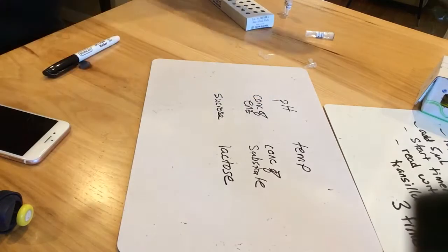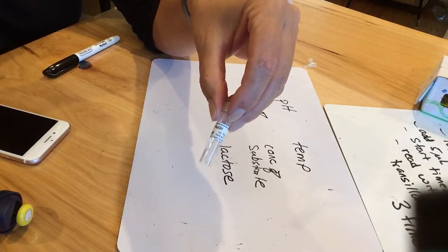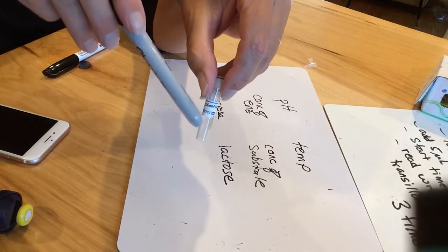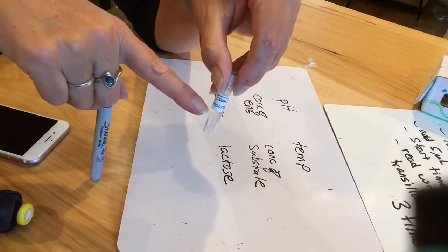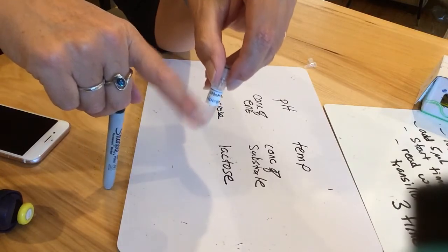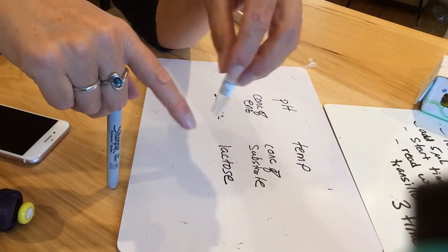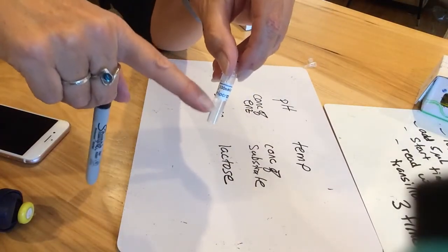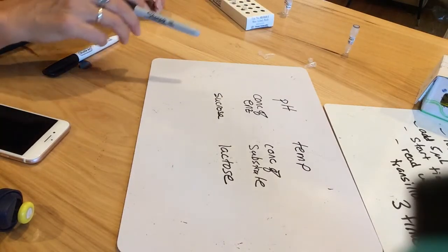And so with pH, you're going to be given a fairly dilute concentration of sodium hydroxide, so you're going to increase the pH by adding small amounts of this sodium hydroxide. I want you to be very careful with this. It can really be bad for your eyes, so you're going to wear gloves when you're handling this, and safety glasses. And if you get any on your gloves, I want you to make sure you take care of that and wash them off, and be careful. You don't want to get that in your eyes. If it gets on your hand or your skin, it's not a big deal. You just wash it off. Okay, so that's what you have.